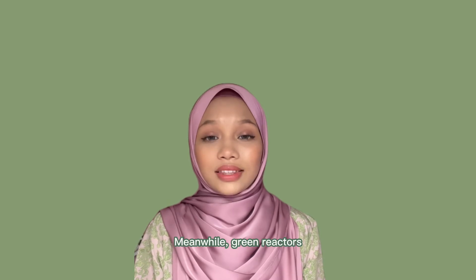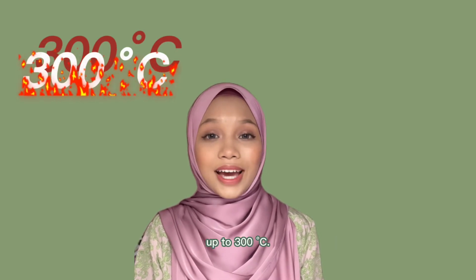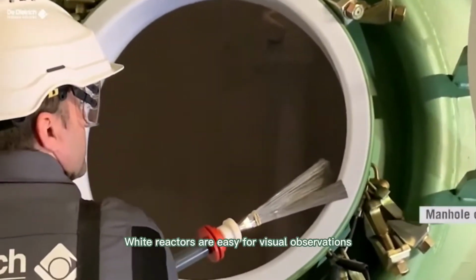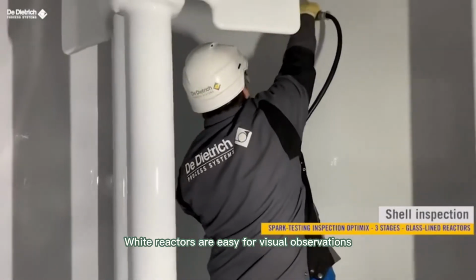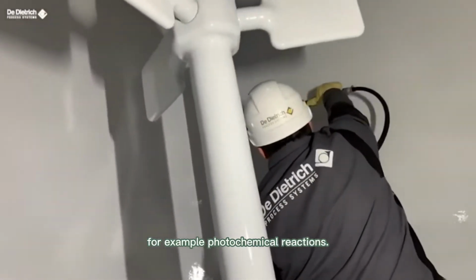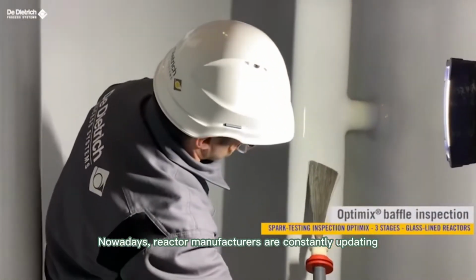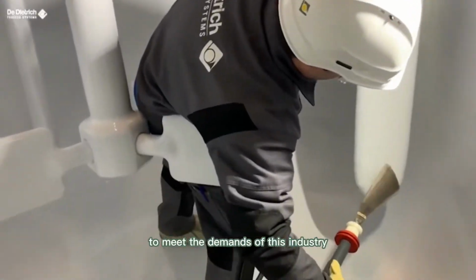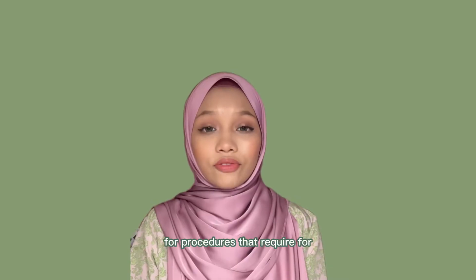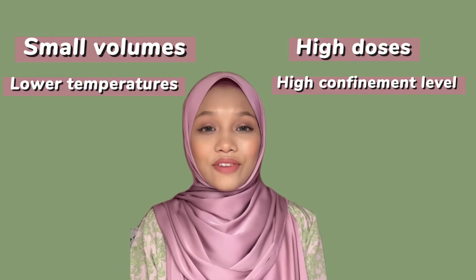Meanwhile, green reactors are suitable for operations at higher temperatures up to 300 degrees Celsius. And lastly are white reactors. White reactors are easy for visual observation of colorful chemicals, for example, in photochemical reactions. Nowadays, reactor manufacturers are constantly updating their product lines to meet the demands of this industry for procedures that require small volumes, high doses, lower temperatures, and higher levels of confinement.